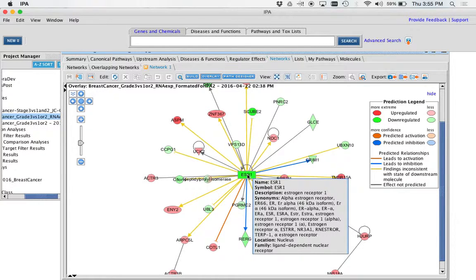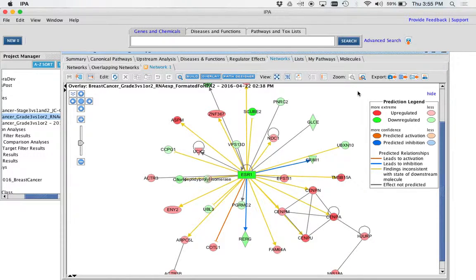You know, when I talk with the high school students, we talk about godfathers. Now, when you're actually analyzing your data sets, you're not interested in the low-level thug selling drugs on the corner. You want to bust the big chief, the big godfather. What you're looking for in the data are things like this that interact with lots of things in your gene list. And we're going to see that in the upstream regulators.